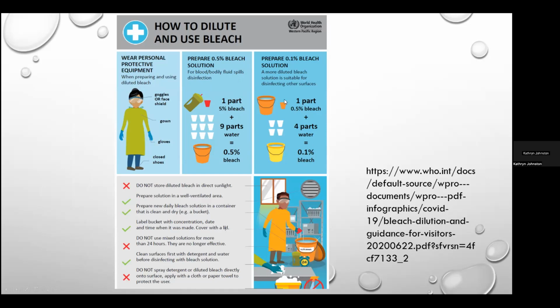But it's important that if you have people who do not have good reading skills preparing your bleach, that pictorials similar to this are important in showing them how to make the proper bleach solutions.